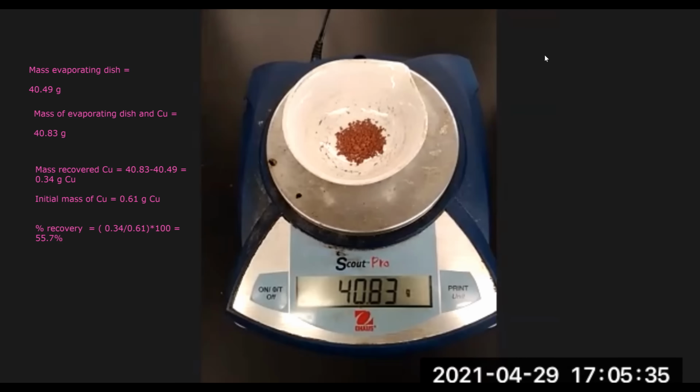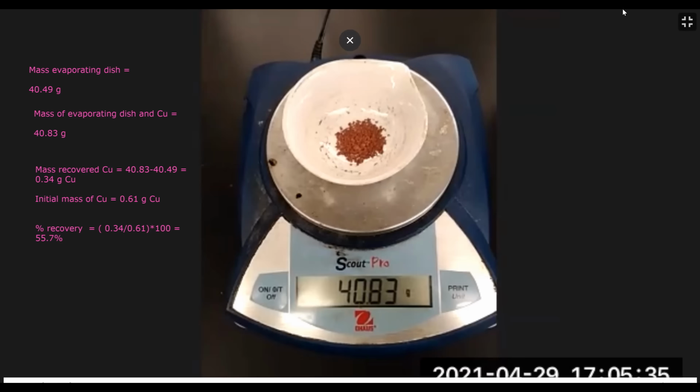So make sure when you're getting rid of your waste that it goes in the correct waste containers. So for the solid, it has its own solid waste container for the copper. For the organic solvents such as methanol and acetone, they have usually their own separate waste container. So make sure you read the label. It'll tell you what goes in each waste container, because if you mix waste, it becomes more expensive for us to have it removed. And so this is pretty much all the calculations you're going to be doing in this lab.